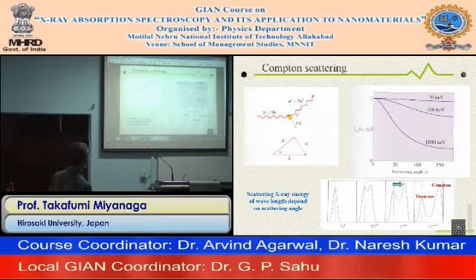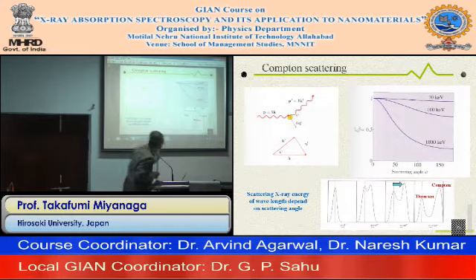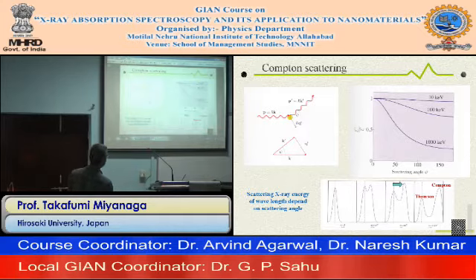That is the profile of the detection of X-ray Compton scattering. At zero degrees, forward scattering, Thomson and Compton are the same, and at some degrees they separate. Thomson is here and Compton is here. At larger angles, the Compton peak shifts to lower energies or longer wavelengths, and so on.